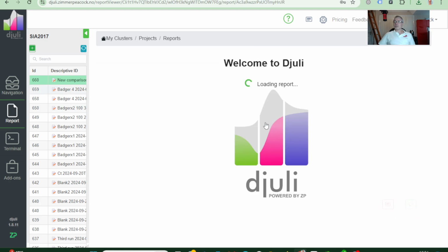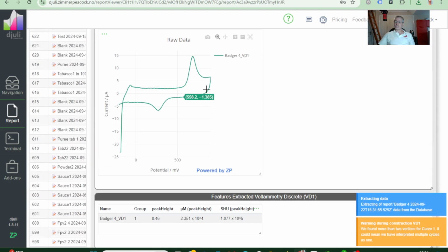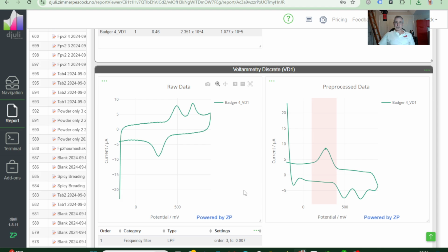Just out of interest as well, I can go into an individual report and see all the raw signals, etc. But of course people are not so much interested in raw signals. What they really want to get hold of is how does my data track with time, when I'm making different batches of sauce.